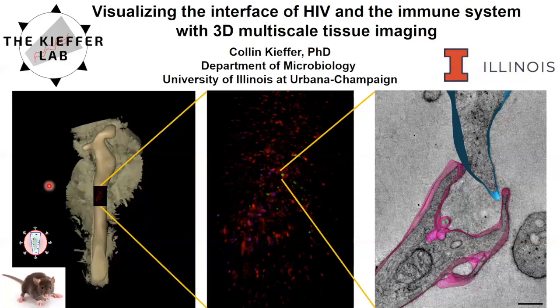Okay. Thanks for the introduction. So, my talk is titled Visualizing the Interface of HIV and the Immune System with 3D Multiscale Tissue Imaging.